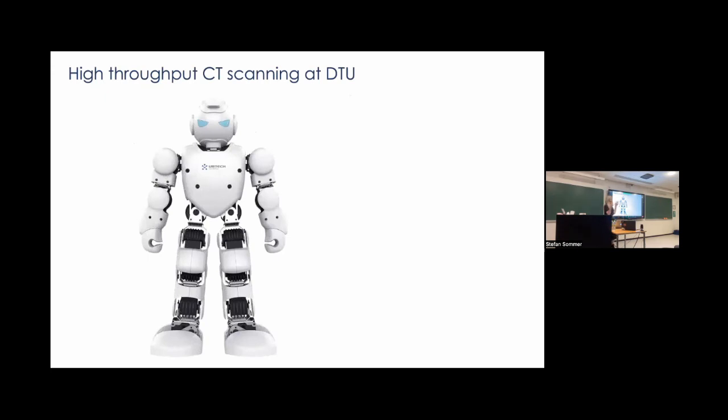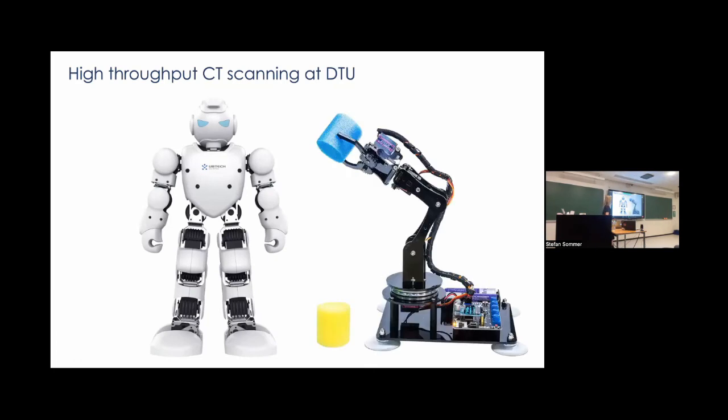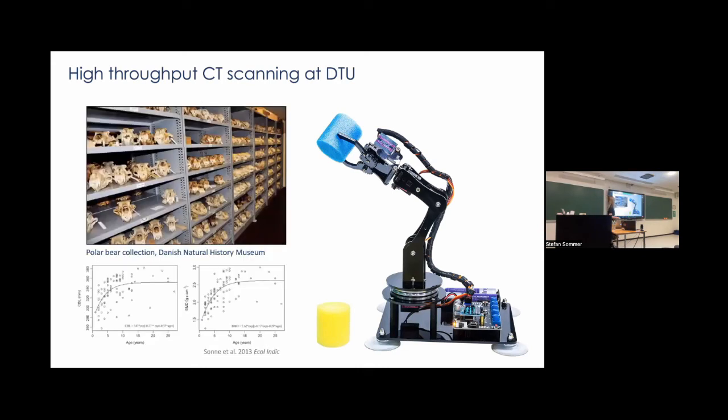So when they told me that, oh my God, robot, I thought, oh, it's going to be something like this. It's probably something more like this. It's a robotic arm that we are working on now with the museum to help select collections that would be most amenable to this, pack them in some standardized way, and then we have a robotic arm that can move them in and out of the machine overnight, over the weekend, right? So the scanning is not the hard part, but you just need the power and the movement to get these things through the system.